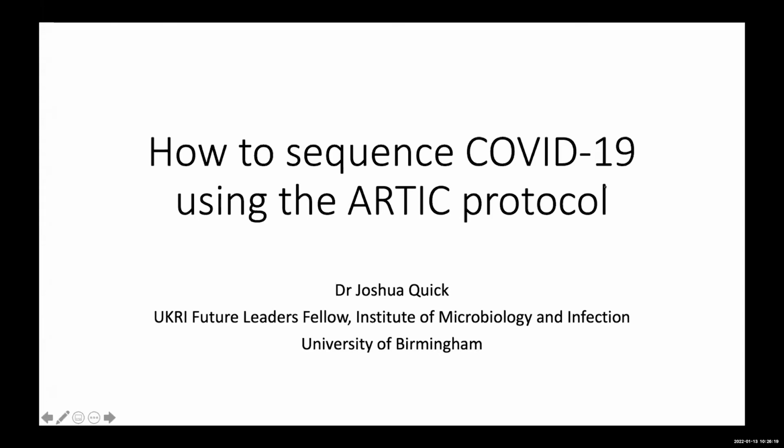So I'm going to try to give you quite a broad overview of sequencing using the ARTIC protocol and the considerations you might want to take into account when you're actually deciding if this is the right method for you.